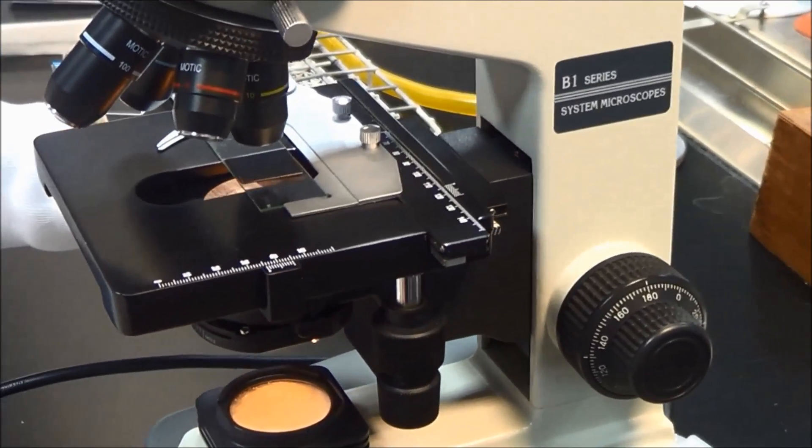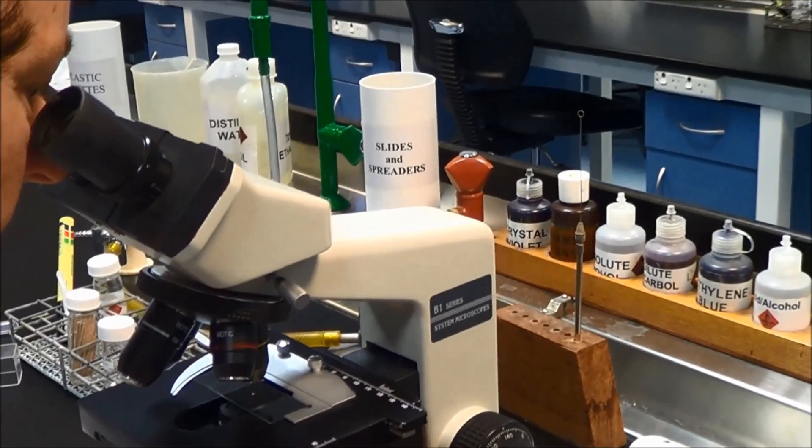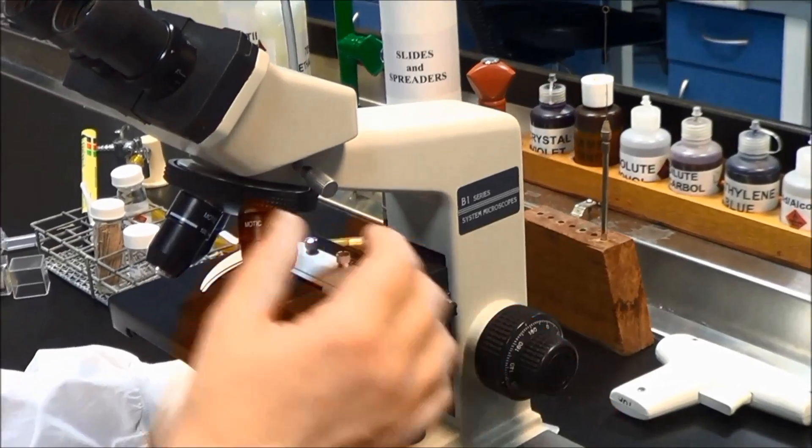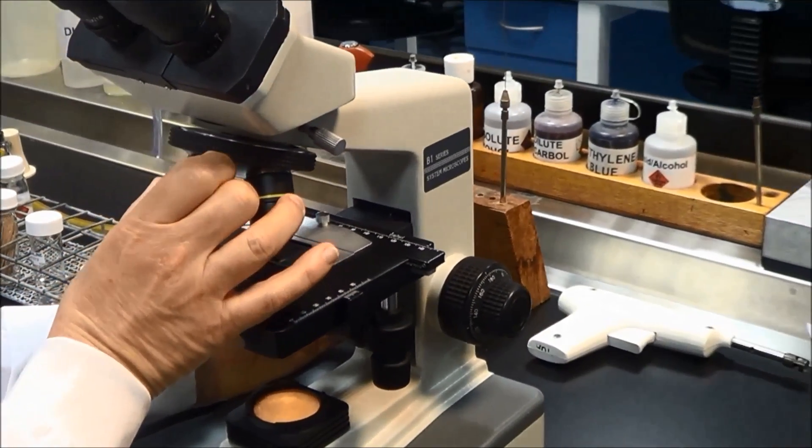Once in focus on low power, move to the 40× objective. If a capsule is present, it will exclude the particles of India ink and the capsule will appear as a clear halo around each cell.